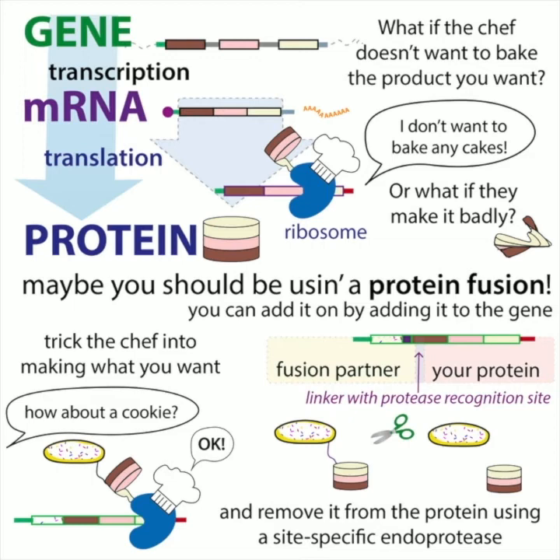In addition to this, these fusion partners can have multiple effects. They can also serve kind of like a chaperone, protecting the ends of your protein, as well as that foot in the door technique, and kind of shepherding your protein throughout the cell to more protected areas.